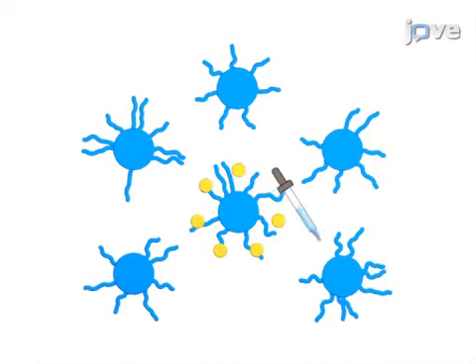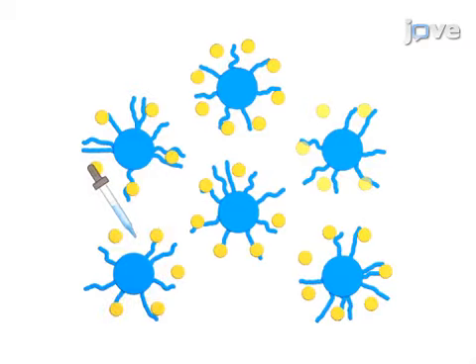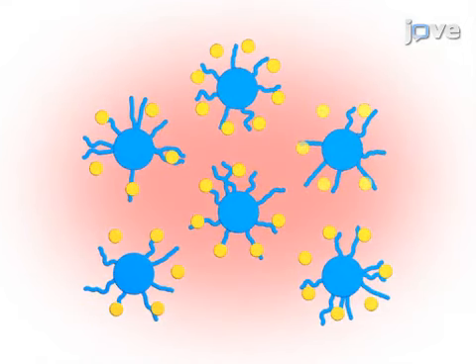A silicon source and a surface modification agent are then added to the solution before adding a gold precursor dropwise to result in nanogold particles. After stirring for 24 hours, the solution is transferred to an oven for hydrothermal processing.